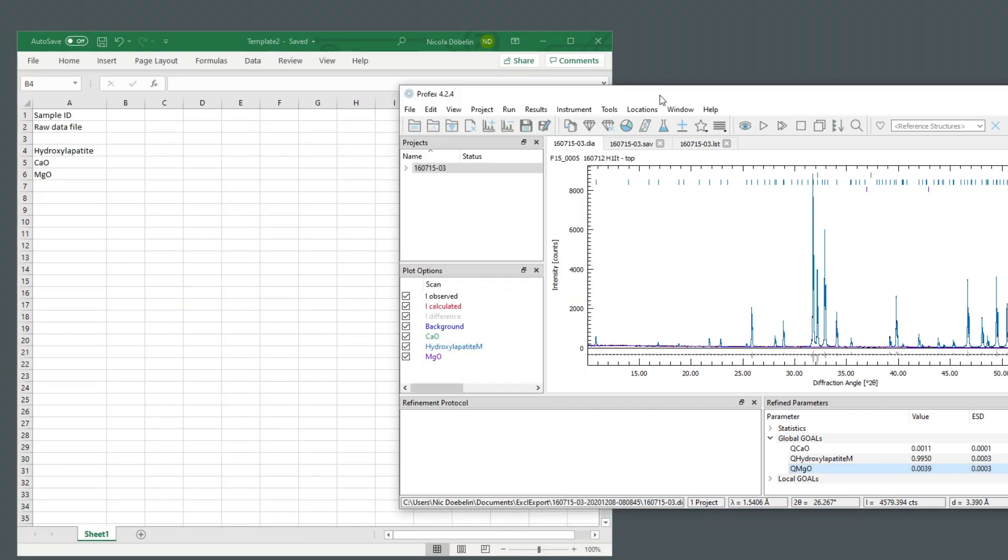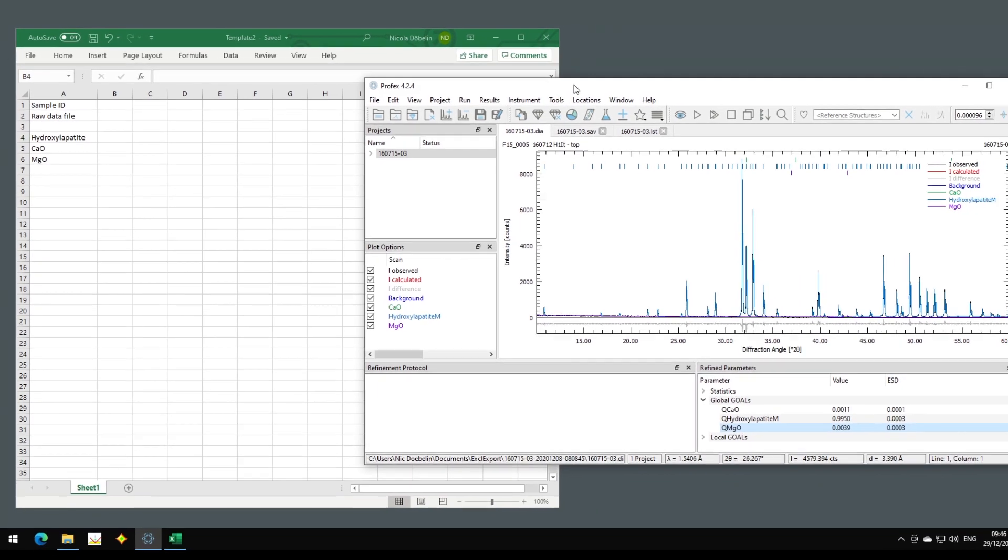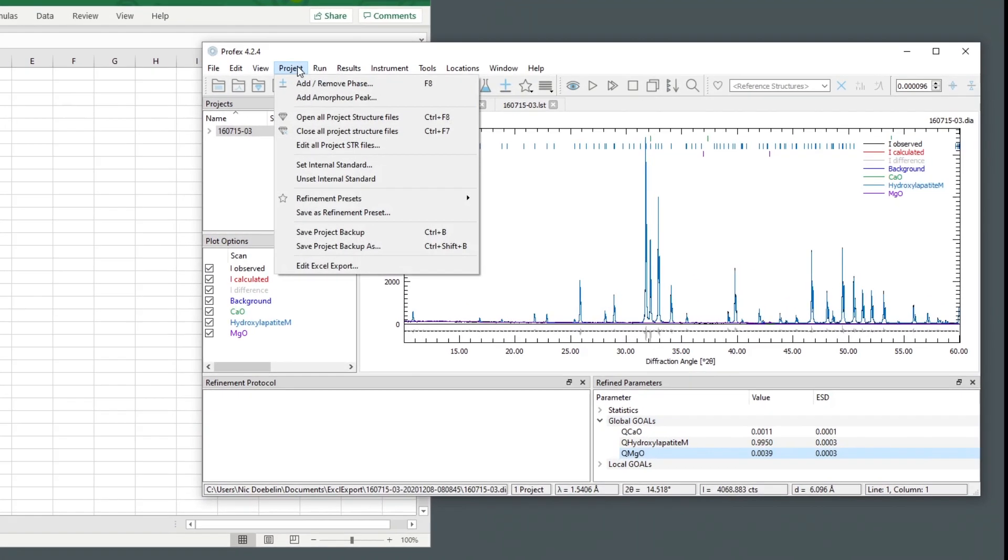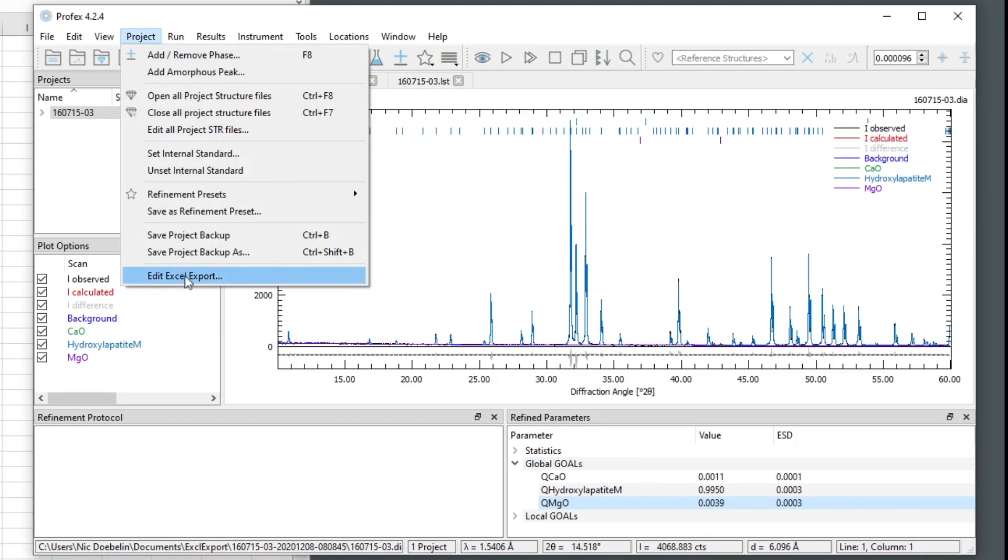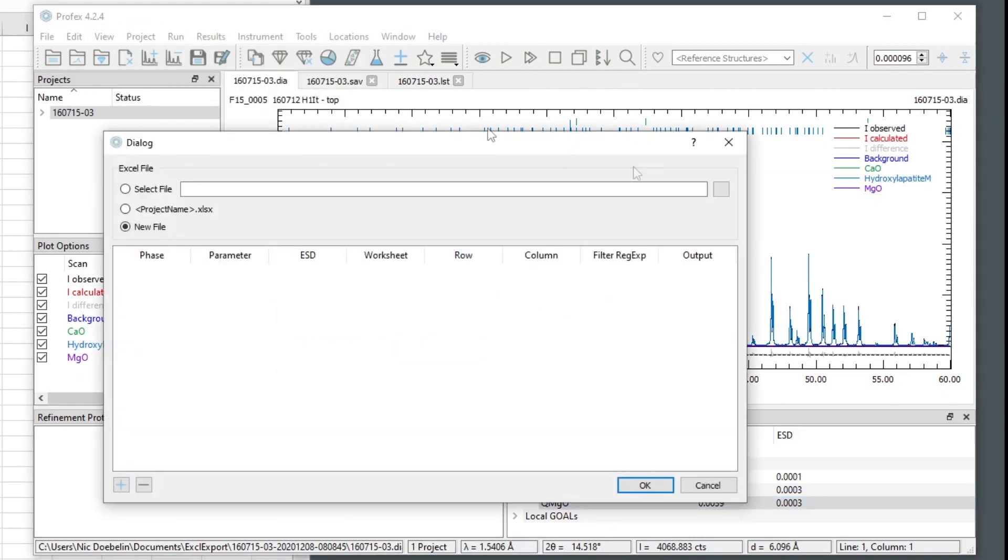And then we have to set up the export in Profex to specify which results go to which cells in Excel. We open the configuration dialog in project. At the very bottom, edit Excel export. And we get an empty configuration dialog.